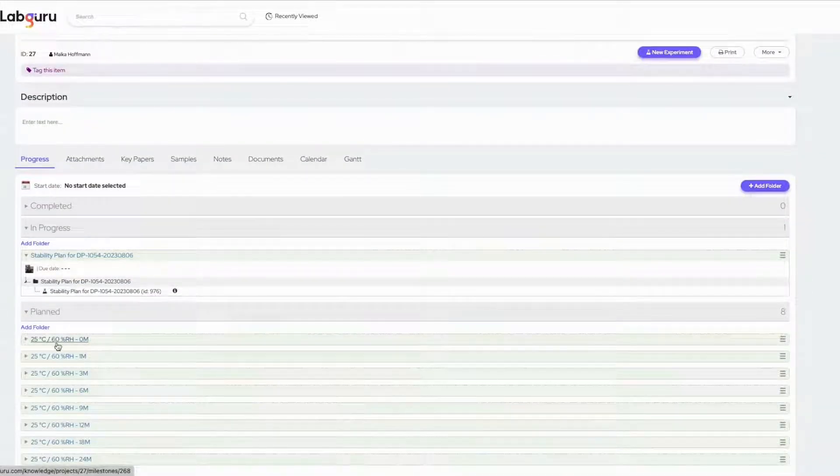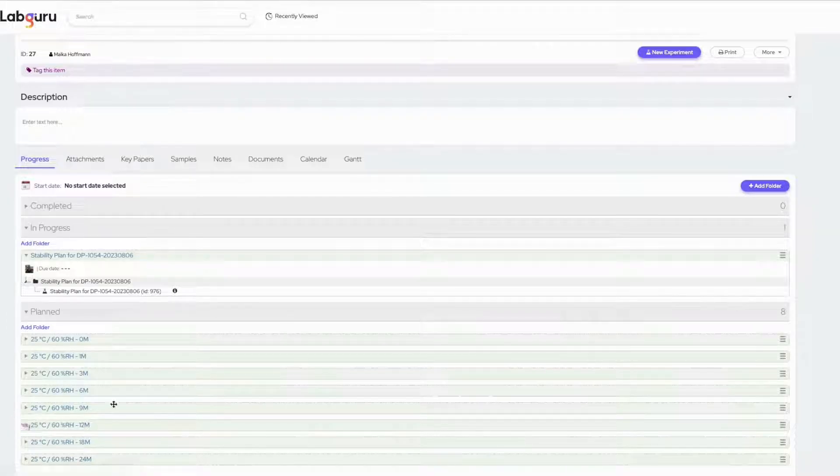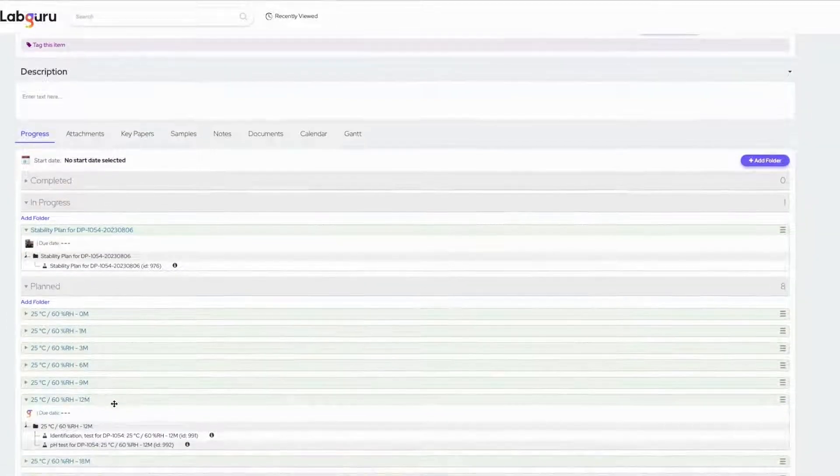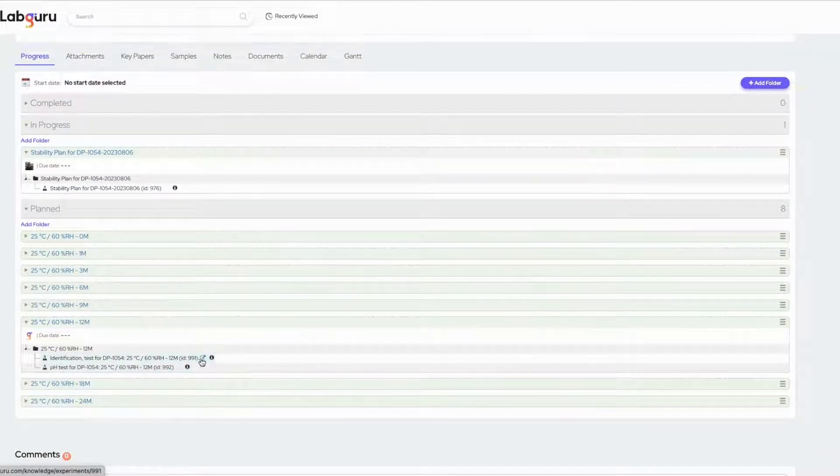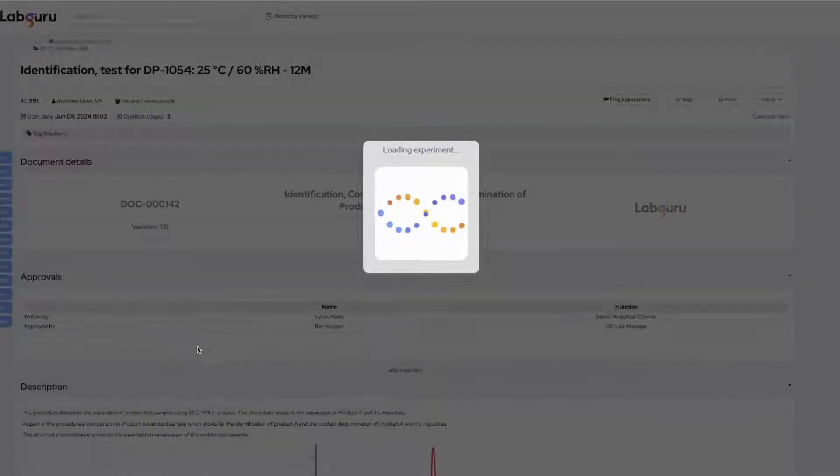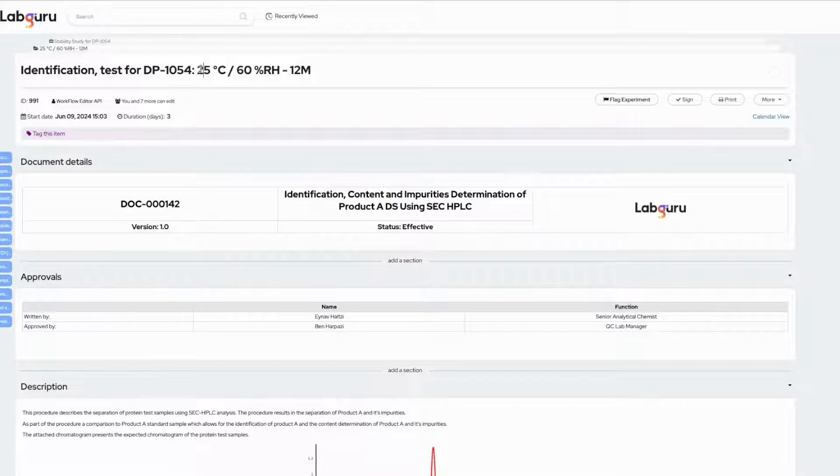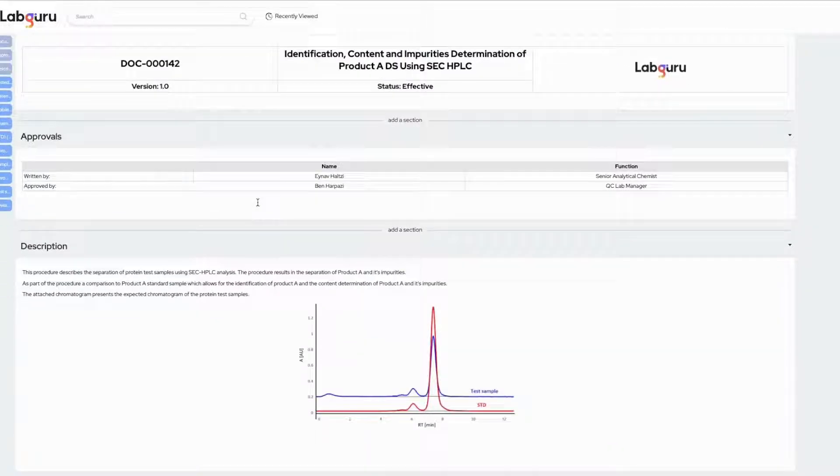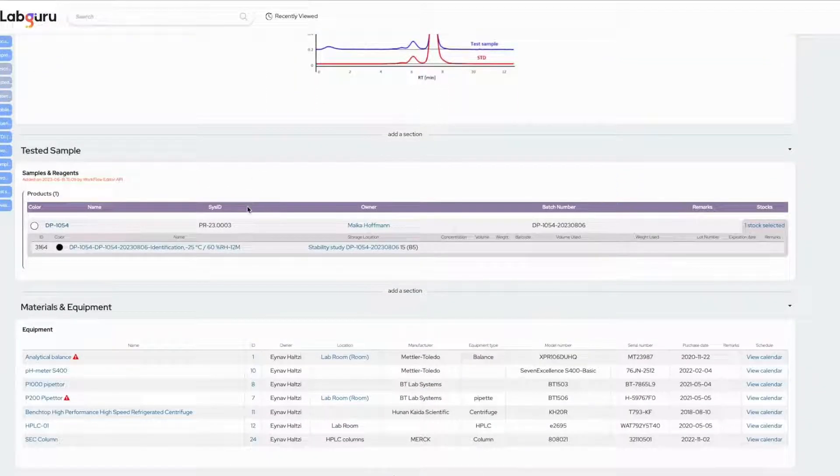The plan status bar is now populated with folders corresponding to the chosen time points and conditions. Each folder contains an experiment initiated from the SOP that was chosen in the stability plan. The experiment name includes information on the storage condition and time point.